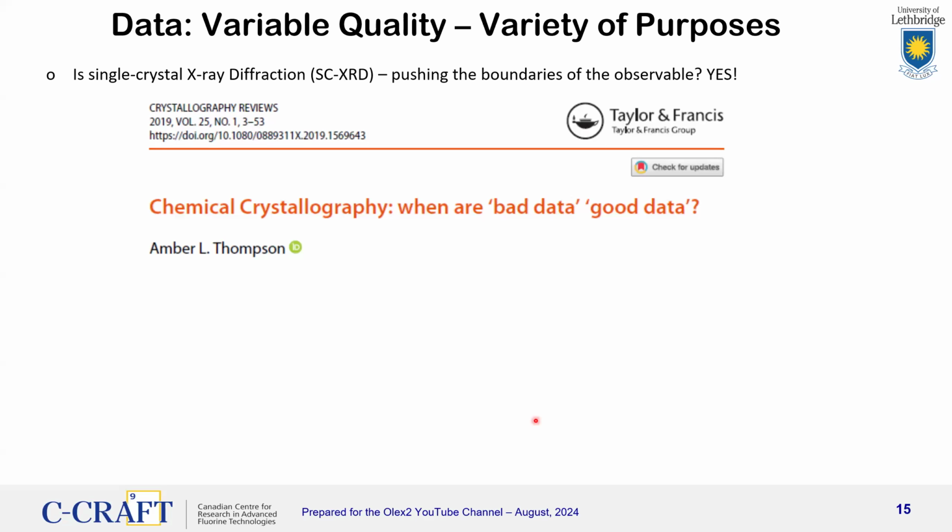If you want to get some more background on this whole idea of being able to measure very poor quality materials and still get meaningful chemical structures from them, I encourage you to read this article by Amber Thompson. So that'll help put that into context.